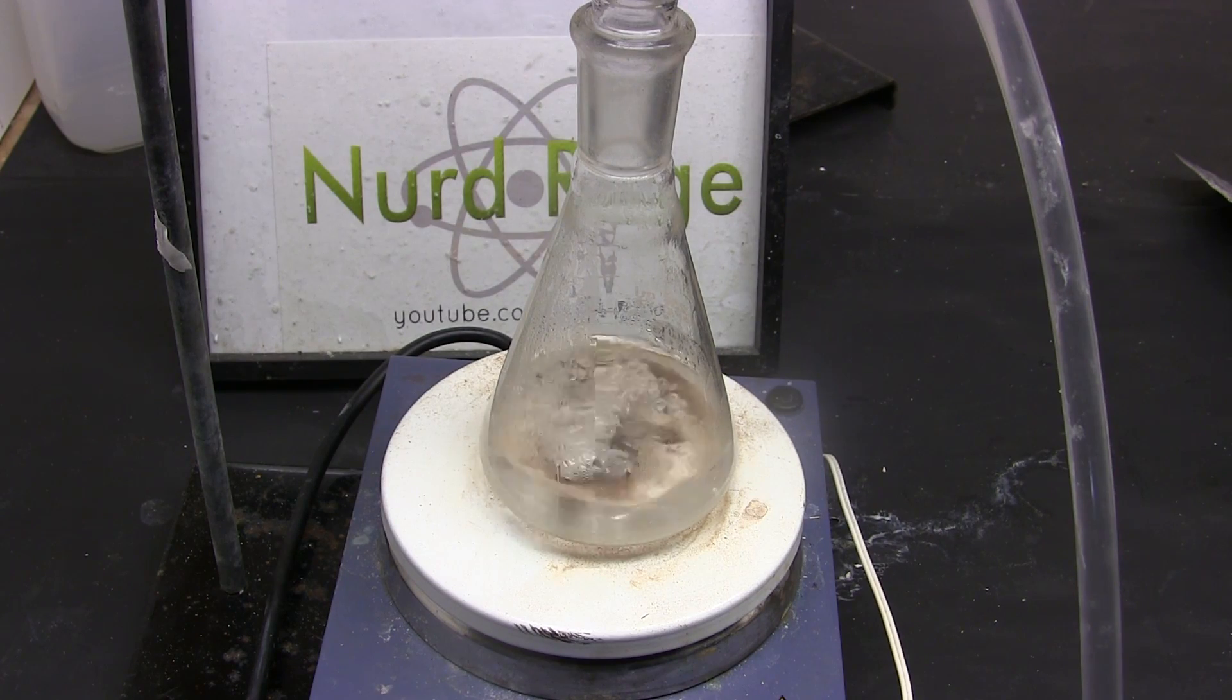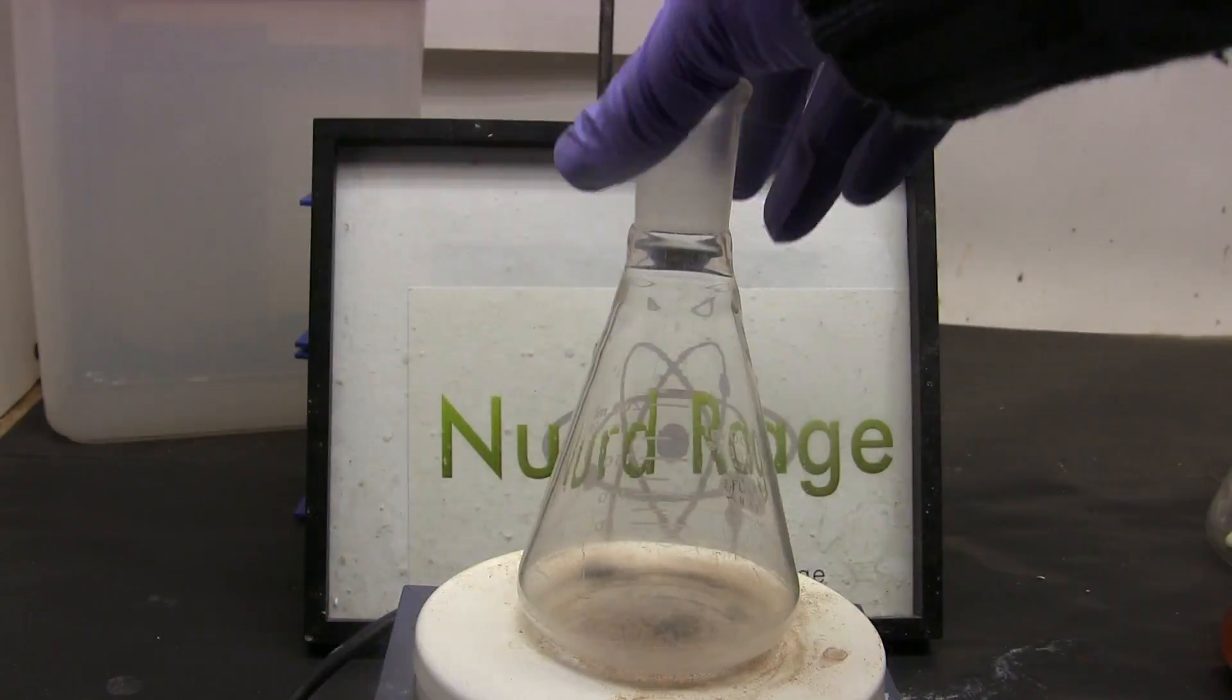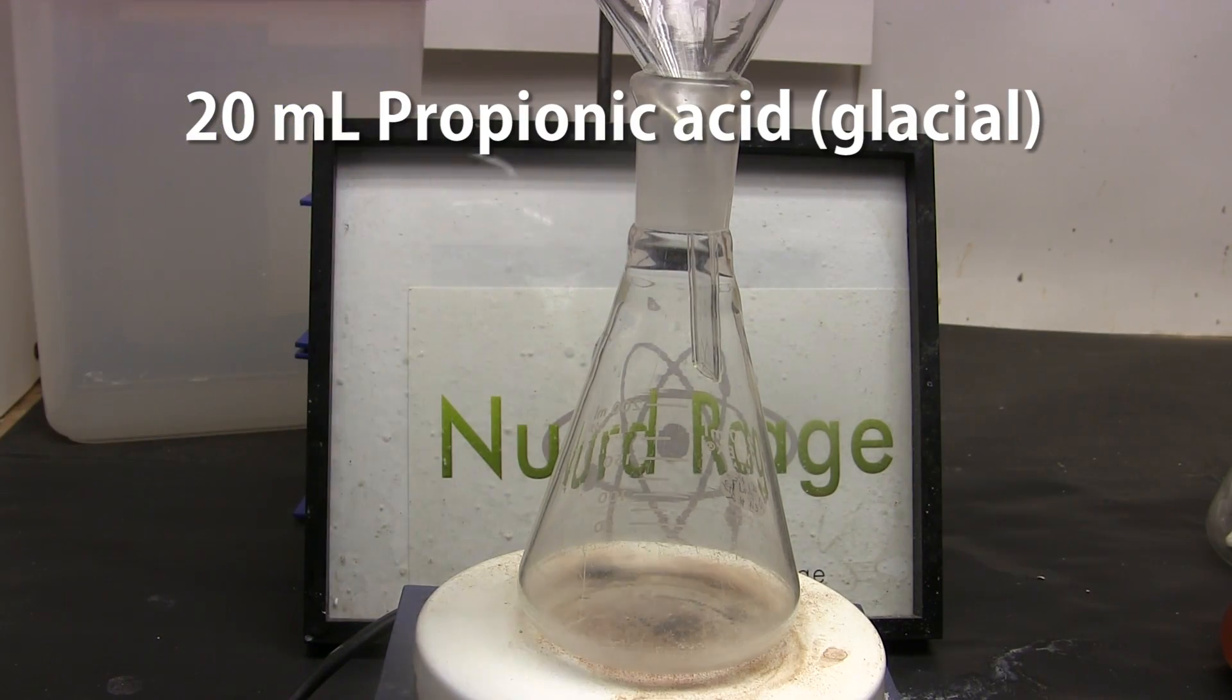Finally we make something that doesn't smell like death. First we start with an Erlenmeyer flask and add in 20 mL of propionic acid.